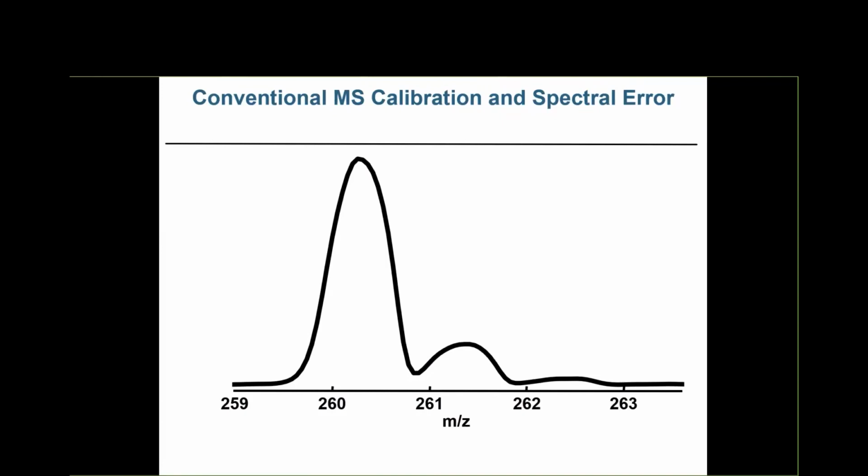If you look at other spectroscopic techniques using electromagnetic radiation to make measurements, whether it's in the infrared, X-ray, or whatever, the line shapes are actually very well known because they're defined by the physics of the optics in the instrument, which is very good and very reproducible. That means that we can measure effectively the shape or the curve of a sample between two different instruments and even two different vendors' instruments, as long as they're at the same resolution. And we can get very accurate matches.